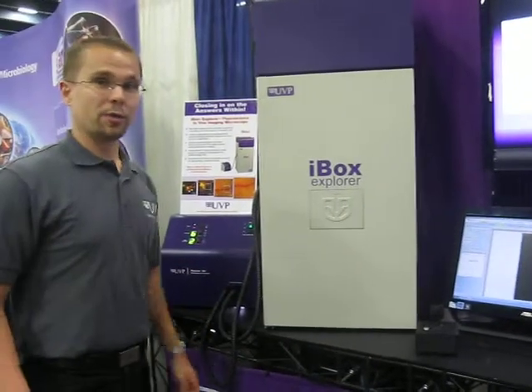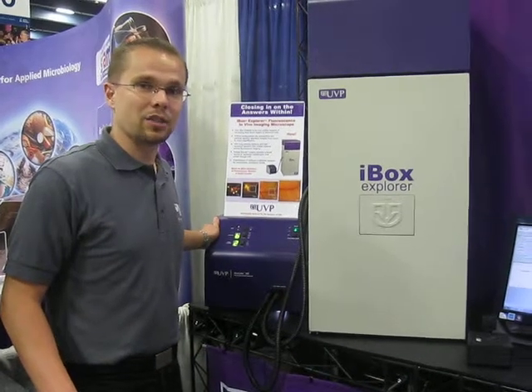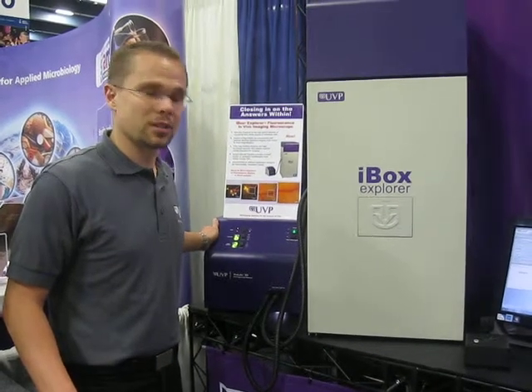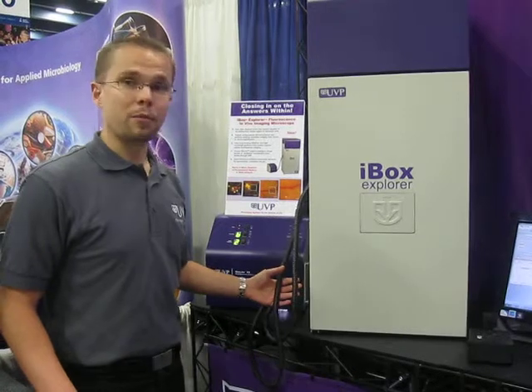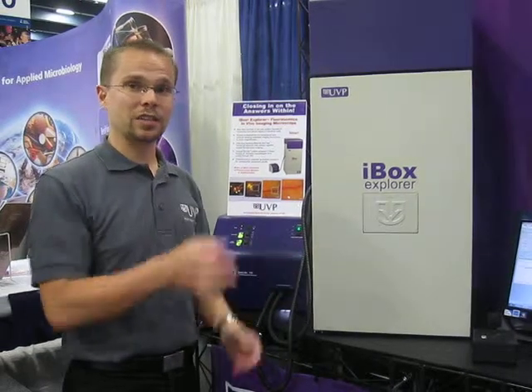All of the lighting provided to the animal within the system is provided by the BioLite XE, which is a 150-watt Xenon light source. This is channeled through two fiber optic cables — one for side lighting of the animal for lower magnifications, and one coaxial, which is a more pinpointed stream of light for higher magnification.